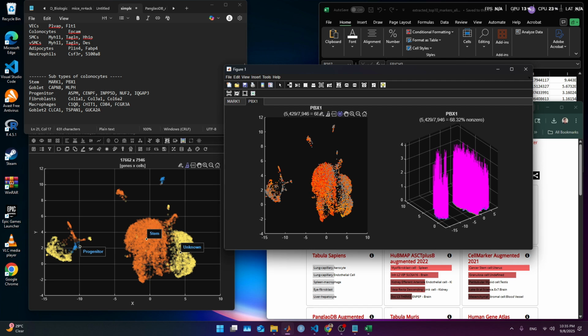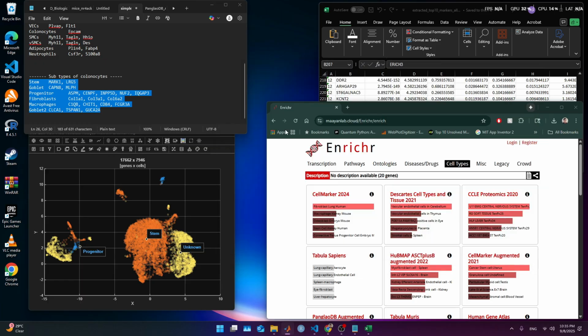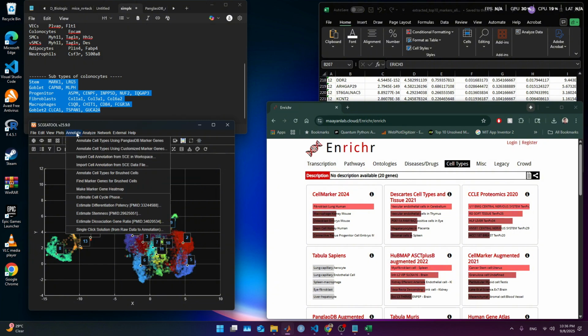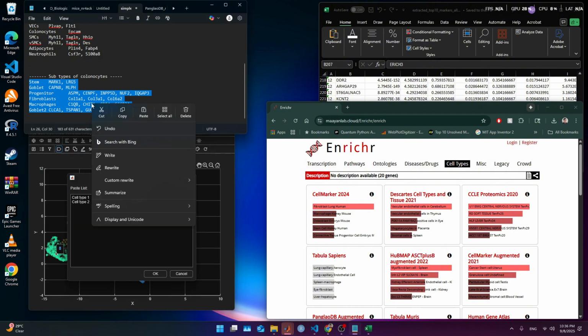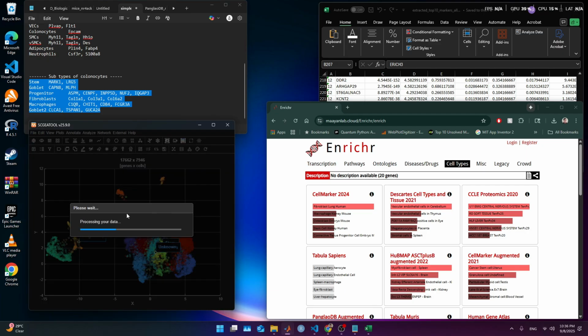Oh, PBX1. So what we are gonna do is we are going to remove this one and include LGR5. That's a classical stem cell marker, and we can utilize that to annotate. The reason I'm removing it's because it's everywhere. That's not informative. So if we do this again, potentially we could get something different. Cluster ID, we show it again and re-annotate. Annotate, copy this, get it here. Yes, automatically.